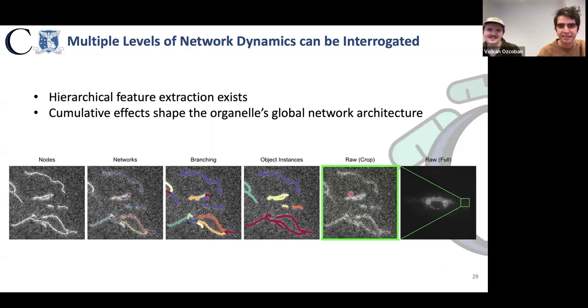All right, amazing. Thanks, Aidan. So to quantify these emergent properties, we measured how dynamics really remodels mitochondrial network topology, connectivity, as well as spatial reach. So how these networks evolve and interact over time.